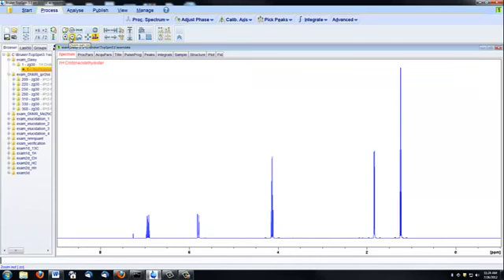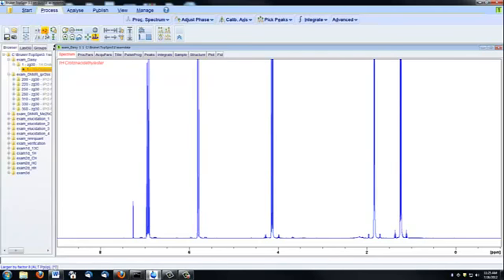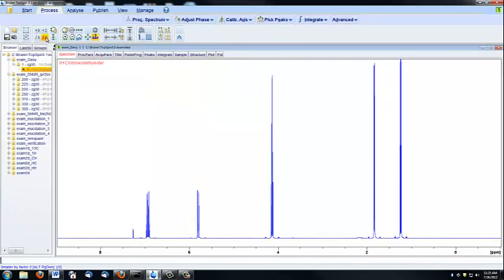know what they do. The first four buttons up here are intensifiers and will either increase or decrease your spectrum by the factor indicated. For example, if we want to increase the intensity of the spectrum by 8-fold, we can click this larger by factor of 8 button. If we want to decrease the intensity by half, we can click over here.